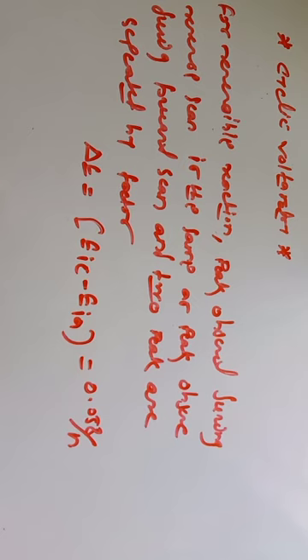The potential at which we reverse the scan is called the switching potential. The current obtained is known as the peak current. We discussed the equation of this peak current, which indicates that the peak current is directly proportional to the concentration.